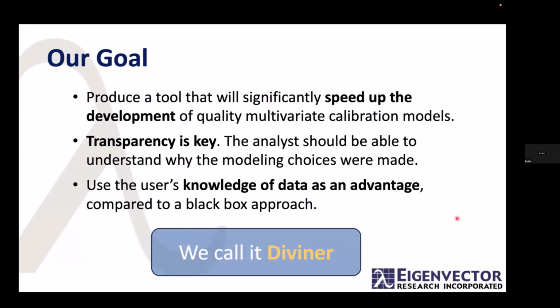Our goal is to produce a tool that significantly speeds up the development of quality multivariate calibration models. And we wanted it to be transparent. The analyst should be able to understand why the modeling choices were made and use their knowledge of the data and what's going on as an advantage compared to a black box approach. And our hope was that you might also learn something from it if you look at all of these models and review them for what's working and what isn't, what's helping your model and what isn't.